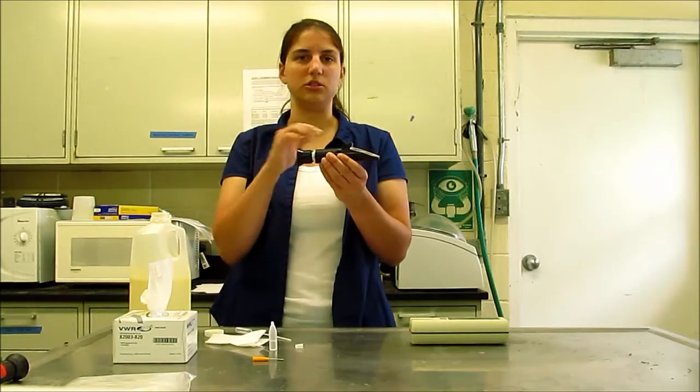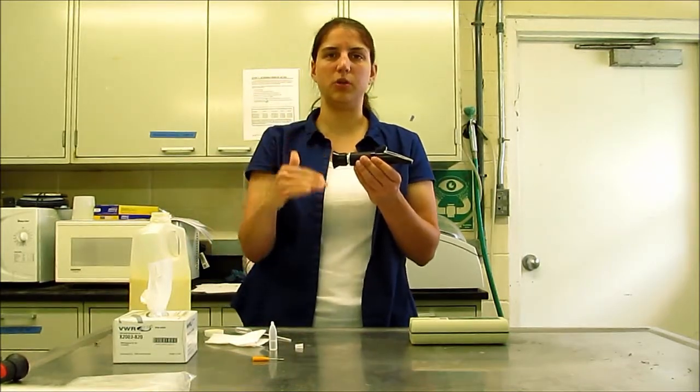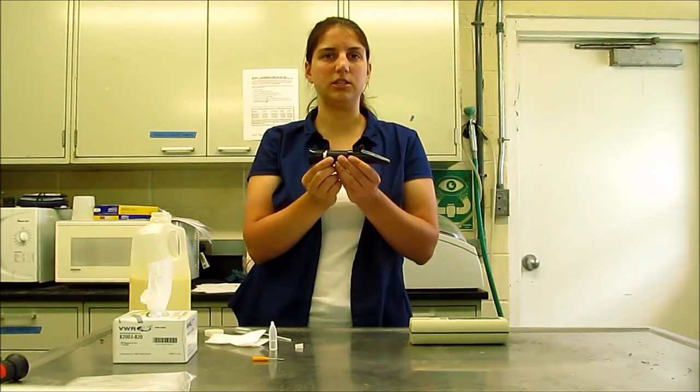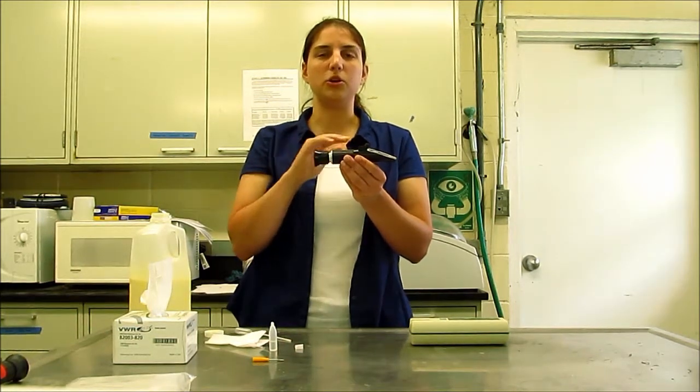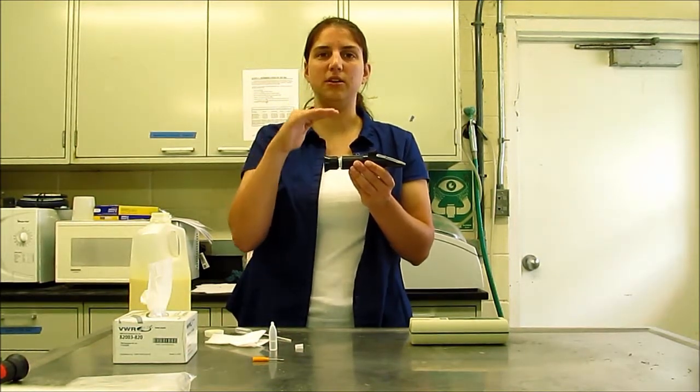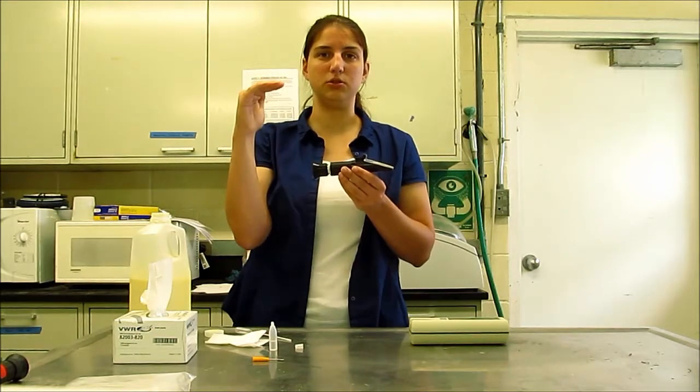Once again, you're going to look through the eyepiece, look for the interface between the blue and the white. With colostrum, it generally is not a very clear line. It'll be somewhat fuzzy. But what you're looking for is for that interface to be above 22, and the units on a refractometer is going to be in percent Brix.